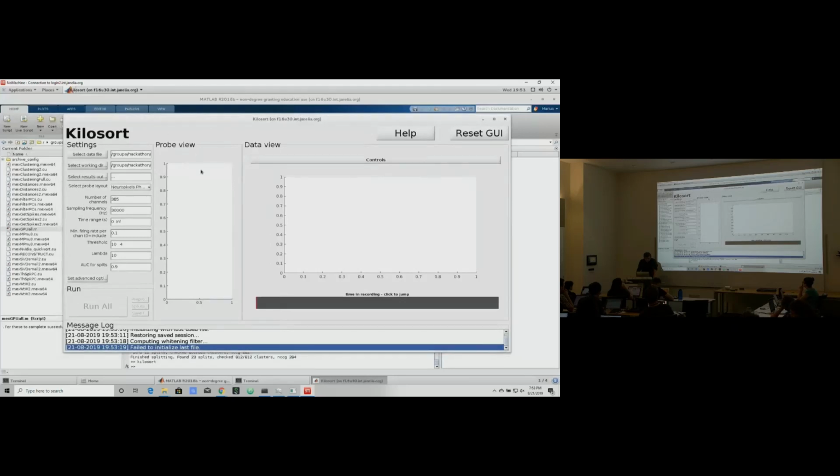Okay, now the first thing that happened here, notice that when I started, it already filled up these things for me. So that's because I had started it before and ran through it. If you're starting the first time, you should see just nothing in all three of these folders. So that's like a clean, nothing should be filled out here. That will be like a clean initialization of the GUI. Because the GUI is trying to remember the thing you did last time, so it loads it for you. But the first time you run this, it should be completely clean. That way you know that you're really running your own new copy, not some other random one from the server.